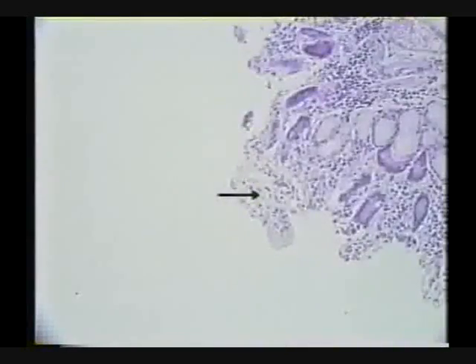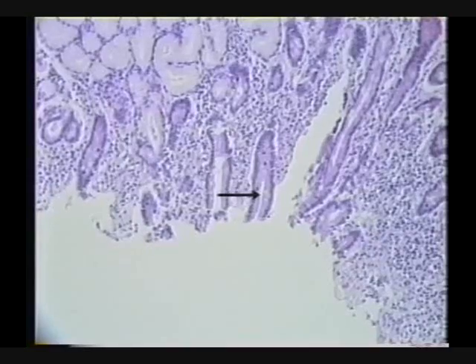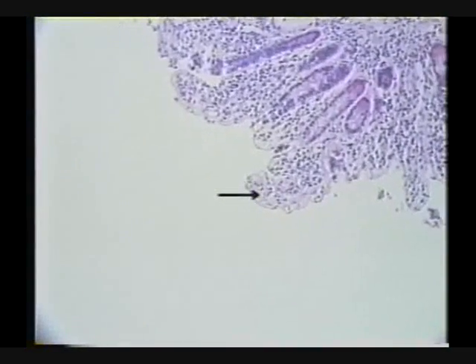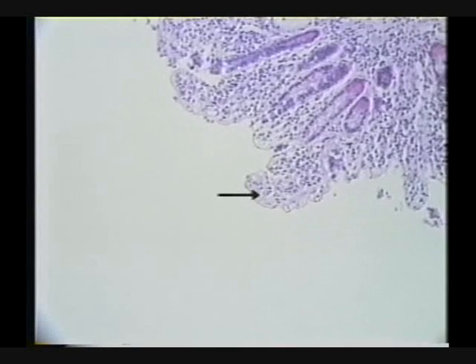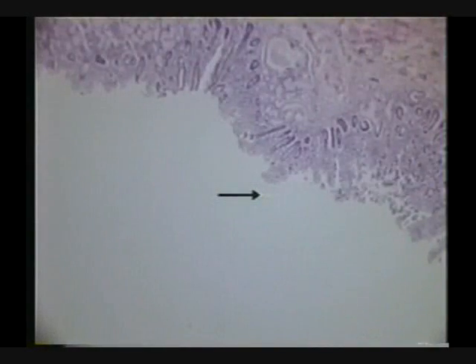Try and find, like here is a villus. What's missing? The columnar epithelium. Okay? The columnar epithelium is all fallen off of these. See, we get down between villi and down into some crypts of Lieberkühn, we can see the columnar epithelium, can't we? Because intestines fall apart. They autolyze very readily. And so this is a typical intestine slide of duodenum.